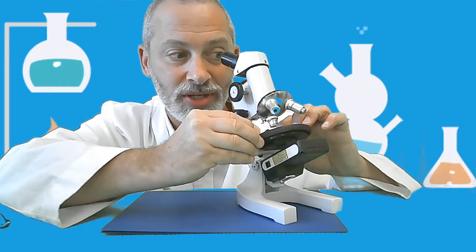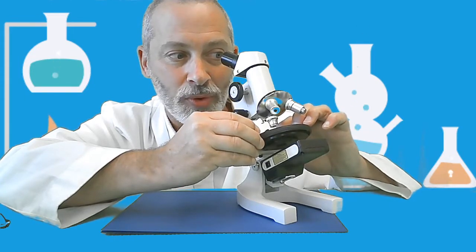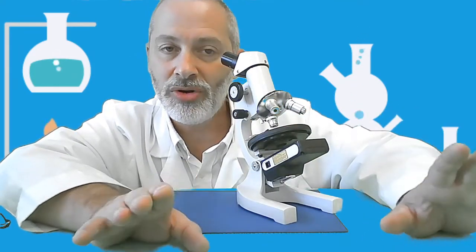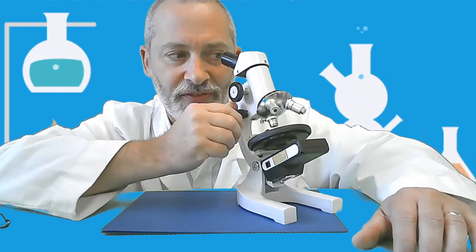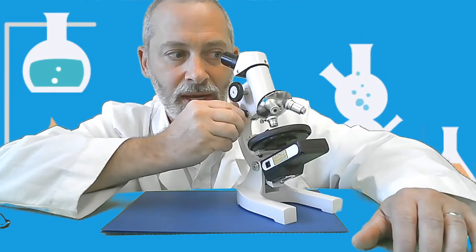Remember, the image is inverted. It is upside down and backwards from what it really is on the screen. So right now, I have the image totally fitting the center of my field of view. And it's a little bit out of focus, so I'm going to use the fine adjustment knob now to get it.